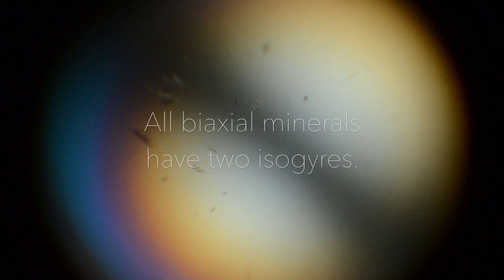This is the interference figure we have obtained. The extinct arm is called an isogyre. Although we only see one isogyre in this field of view, it is important to note that all biaxial minerals have two isogyres.